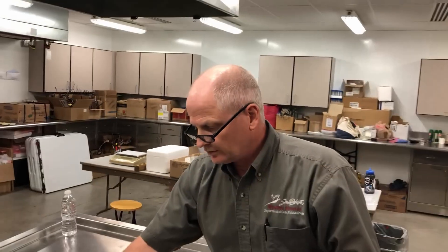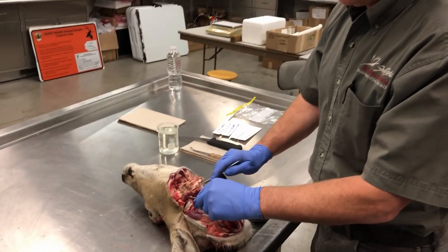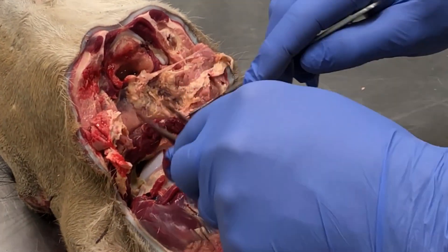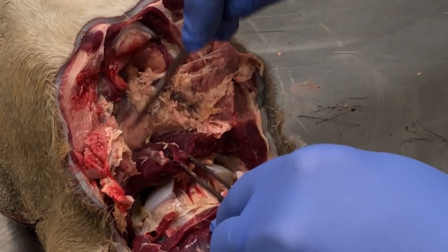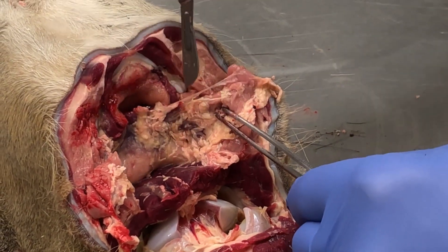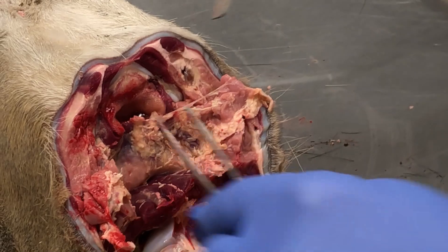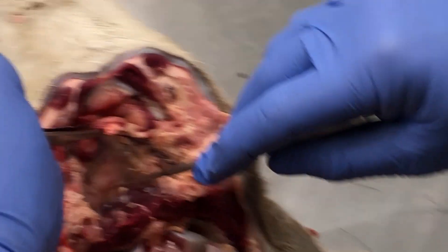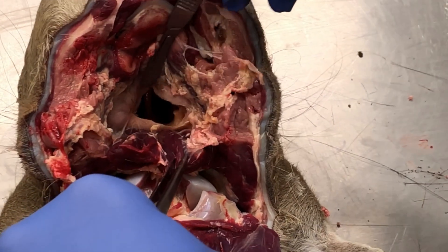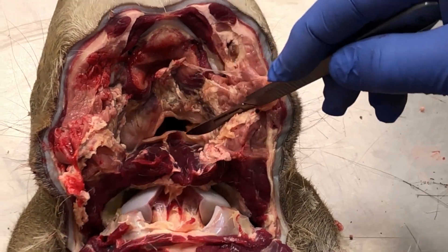And there you have your other retropharyngeal lymph node. So in the end, what you're going to look for on this animal again is you're going to look for these two muscle tissues right above the occipital condyles. And as you peel that back, those nodes will be right down here and you'll see the opening or the voids where those nodes were. Another thing — if you go too far in, and you cut here, you've cut into the throat, and that means you're way too deep. You don't need to be that deep.